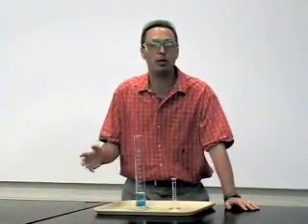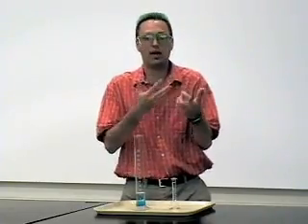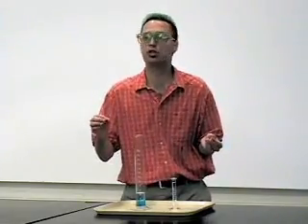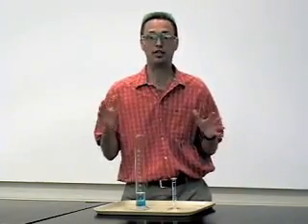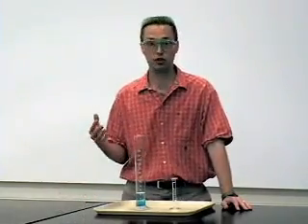Today we're going to talk about chemical reaction rates, which is how fast chemistry happens. How fast two molecules might bump into each other and become a new kind of molecule. And there's a lot of different things that can affect how fast chemistry happens. Today we're just going to focus on concentration. And to do that, we're going to use an old standby chemical demonstration called elephant toothpaste.